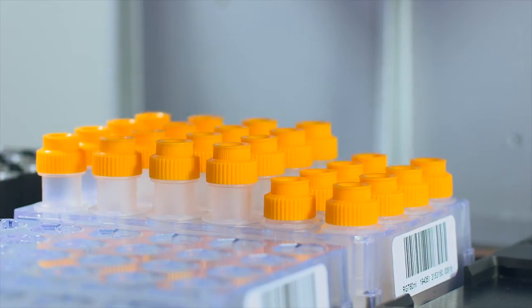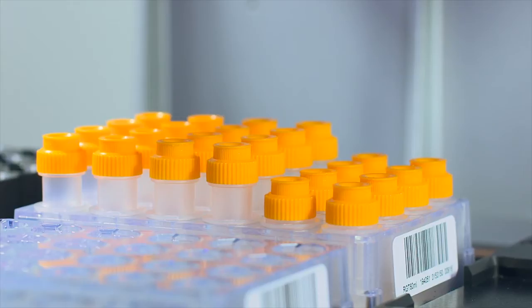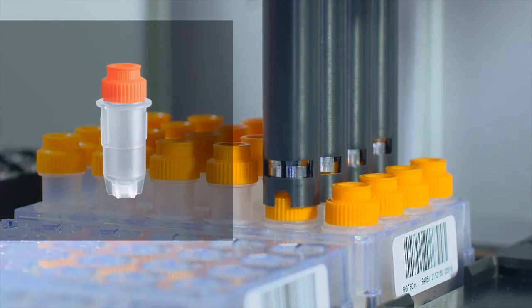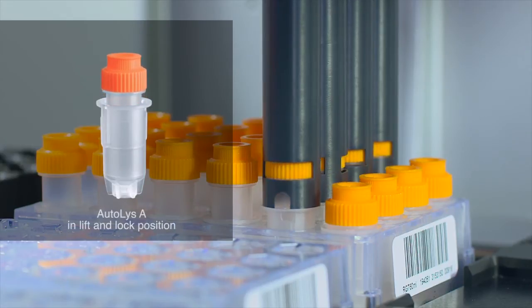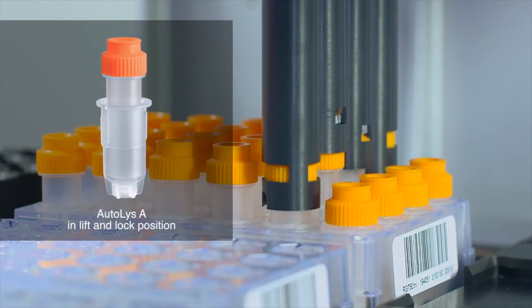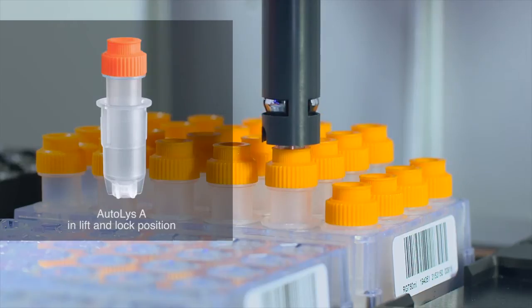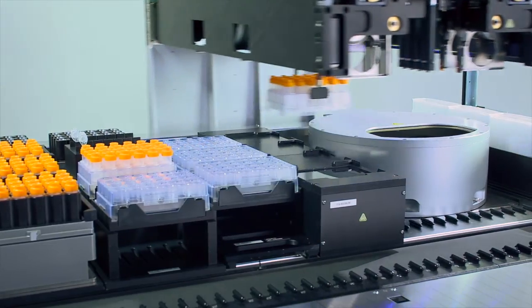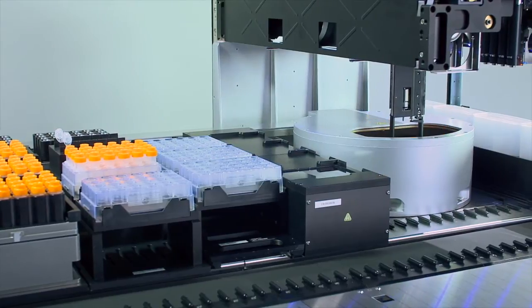After the initial incubation with shaking required by the sample lysis, the Autolis Tube is transformed into a spin basket by special Autolis channels without human intervention. The resulting lysate is then filtered into the outer tube by centrifugation to guarantee the best sample recovery and highest yields.